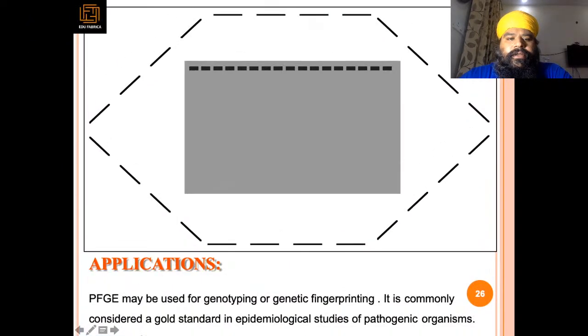Sorry. So they may be used for genotyping or genetic fingerprinting, and it is commonly considered the gold standard in the epidemiological studies of pathogenic organisms. So quite a useful technique also.